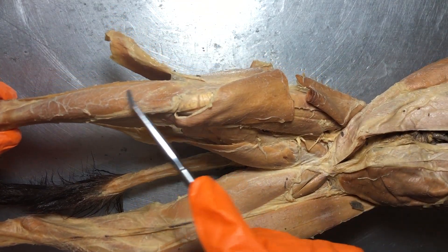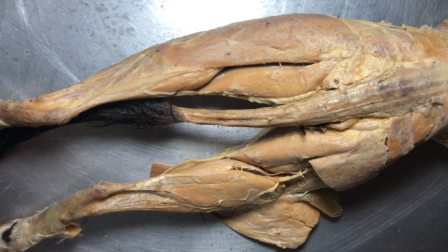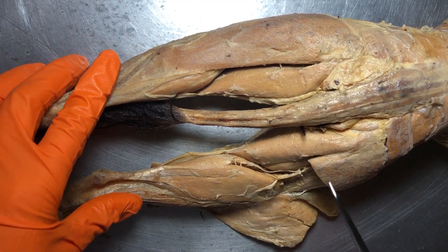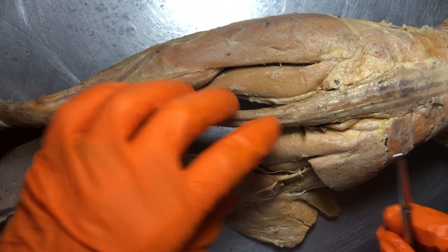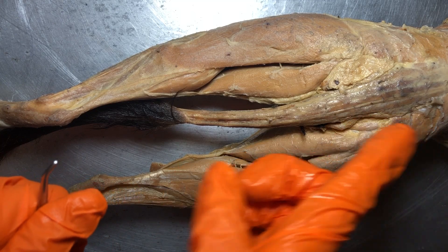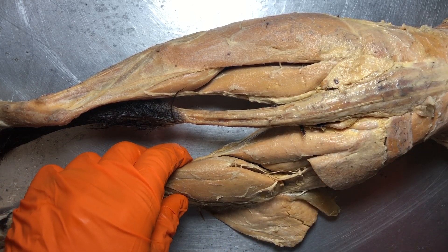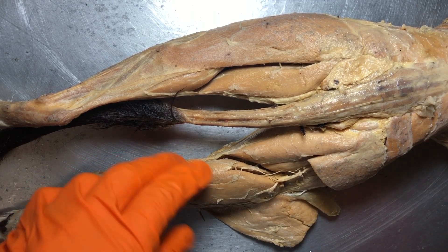On the anterior side here, this is going to be our tibialis anterior. I have flipped our kitty cat over, so now we're looking on the back sides of the legs. Just a quick reminder about terminology on a quadruped: because a kitty walks on four legs, this is actually the superior surface, underneath is the inferior surface, anterior is towards the head, and posterior or caudal is towards the tail.